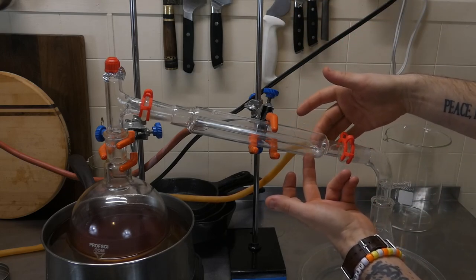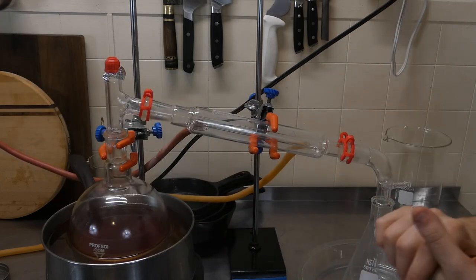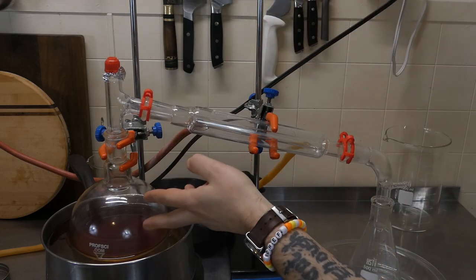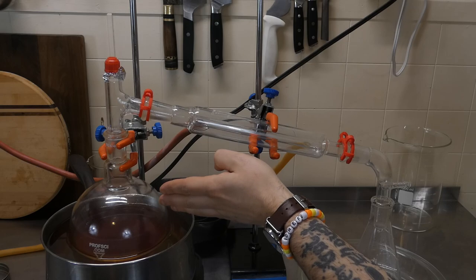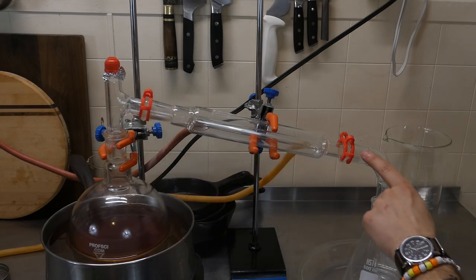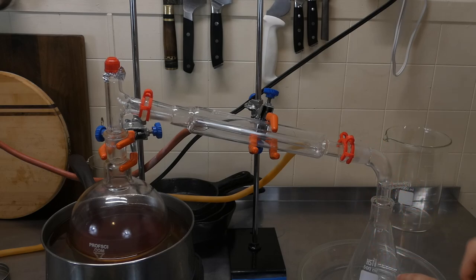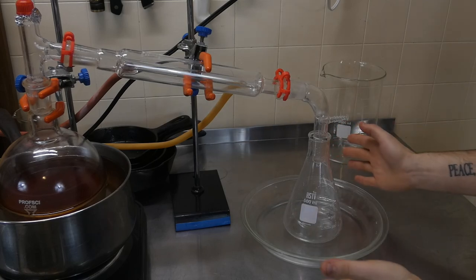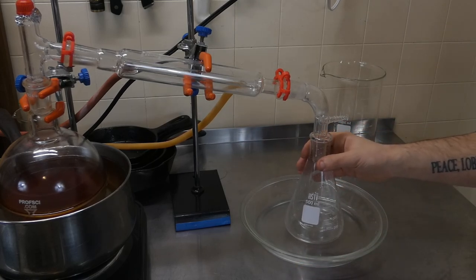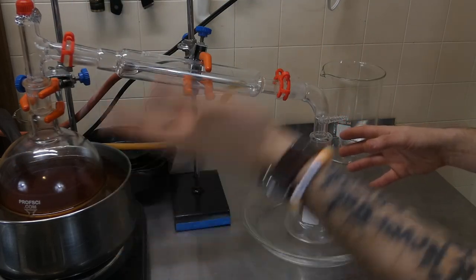It works the same way as the top of the Soxhlet extractor did. Cold water comes in through here, comes up, and goes back down into the bucket to keep recirculating. The cold condenses the steam from the capsaicin extraction, and it drips down here. It'll be pretty much pure ethanol by the time it comes down into the flask. I have a little pie dish underneath just in case something bad happens and everything pours in at once because of boil over.